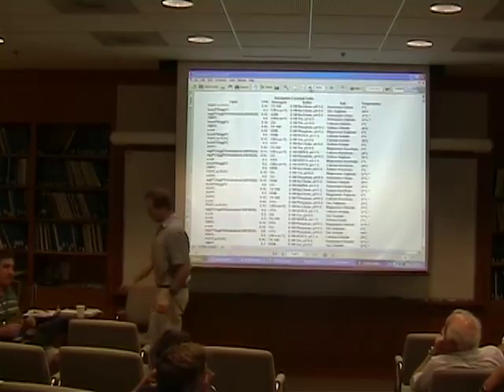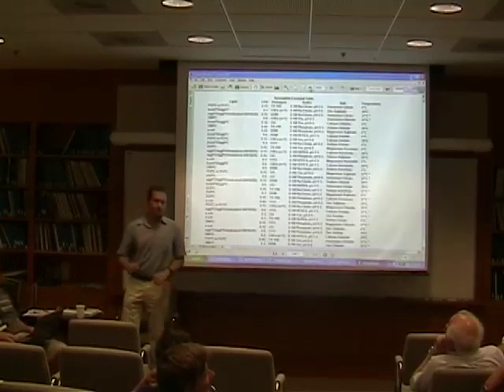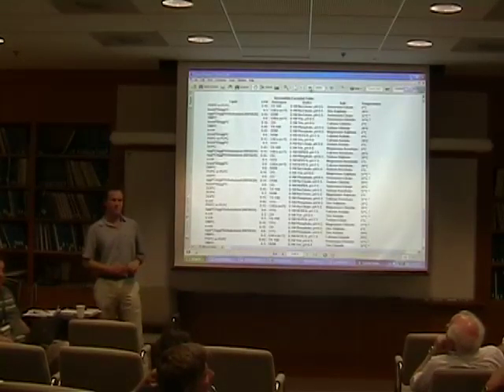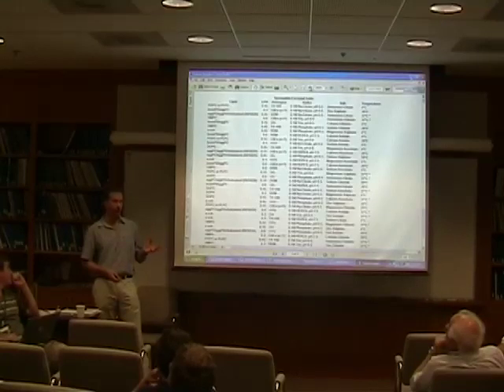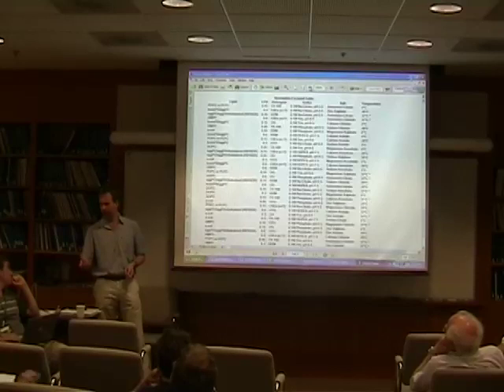I have a problem with detergent. Are you going to purify it in 5 different detergents all in the same day? It's not practical, is it? I mean, no, the thought was really to purify your protein in whatever detergent you choose, and then add a detergent as a separate thing. I think we have to make the screen simple or people won't use it. It adds a little bit of complication, but at the moment we're just trying to do a wide screen. So Michael, could you just go back to the front page?